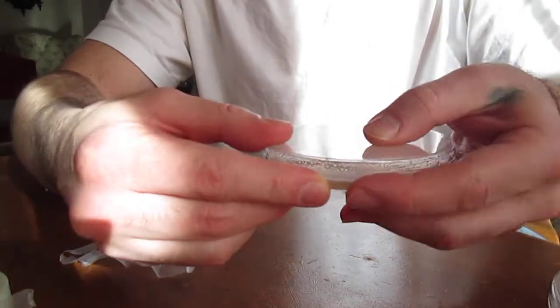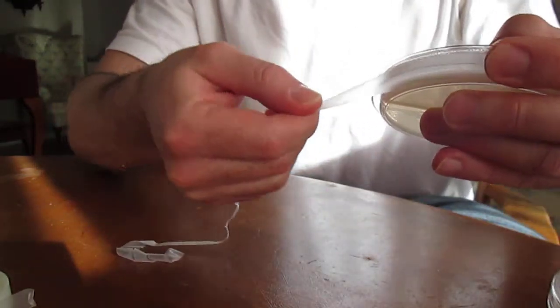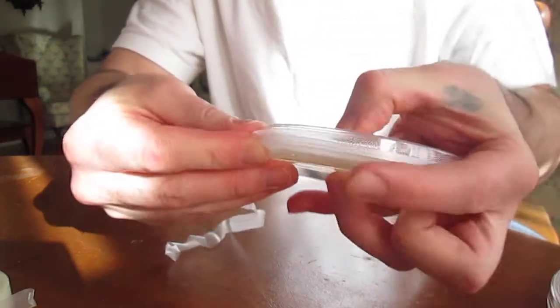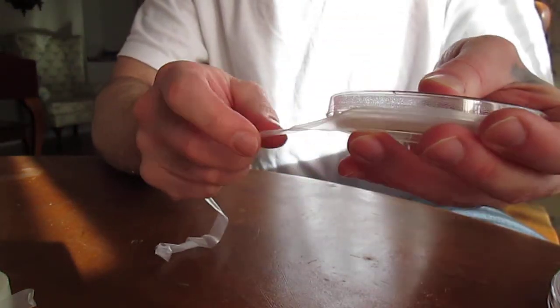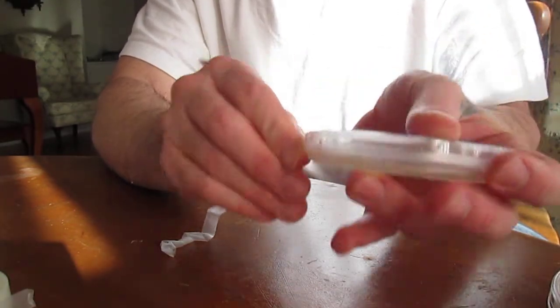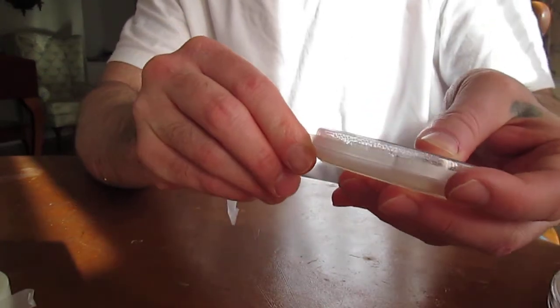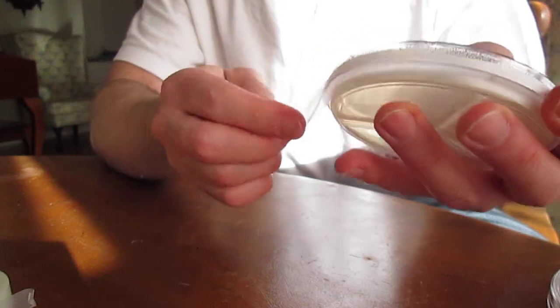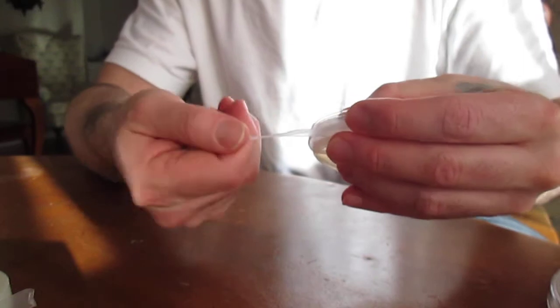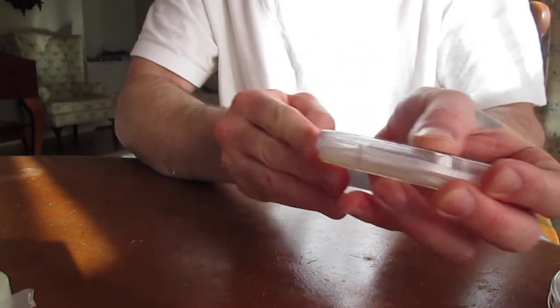Pull it all the way around the dish two times. One time you would think would be enough, but it's not. One time will still be a little bit porous and allow things to get in there. So two times will keep it sterile. Just pop it on, pull it tight and swing it around.